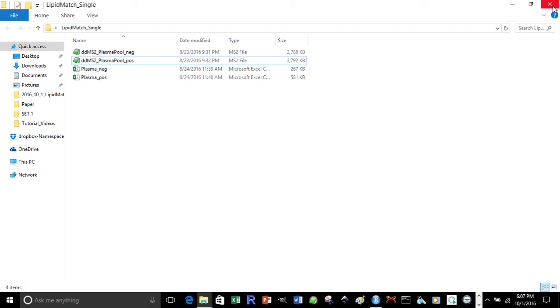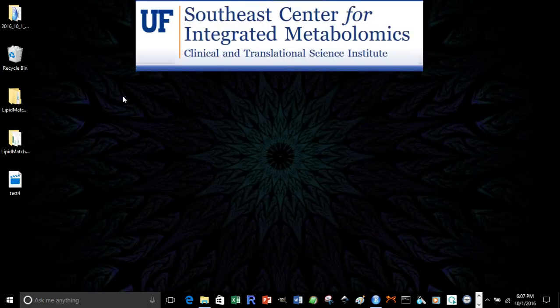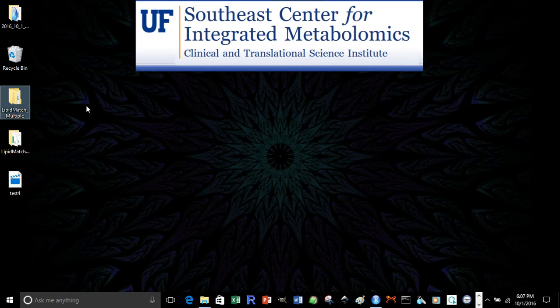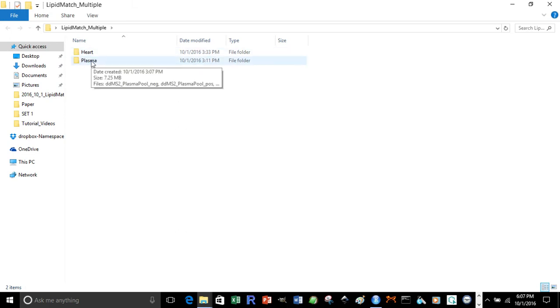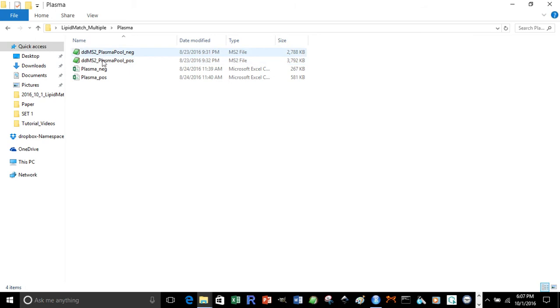Now another way that these folders could be organized is you'd have one parent folder, but maybe you have multiple experiments you want to run LipidMatch on simultaneously. So in that folder you can have your different experiments, let's say heart and plasma, and so inside it would be organized the same way as that one single folder.